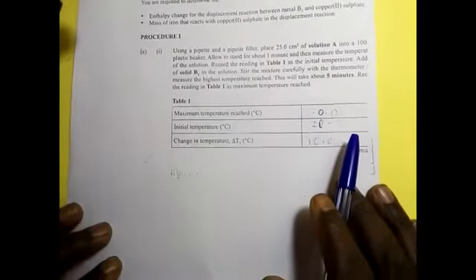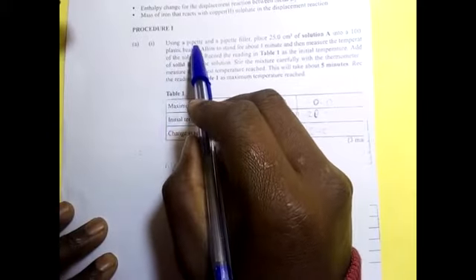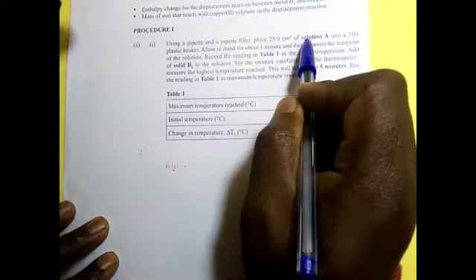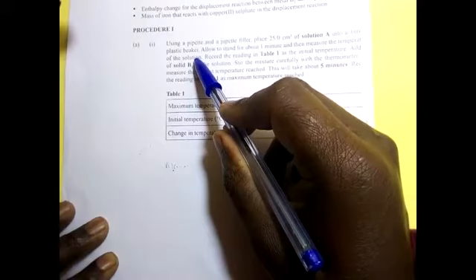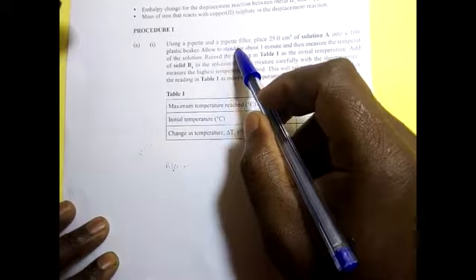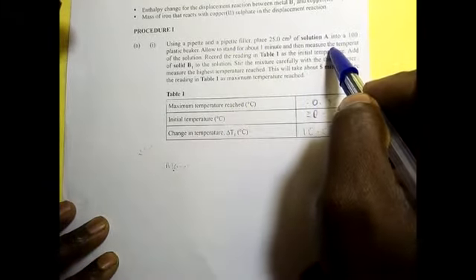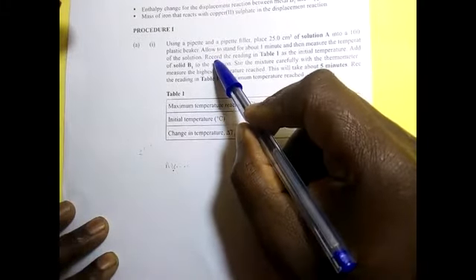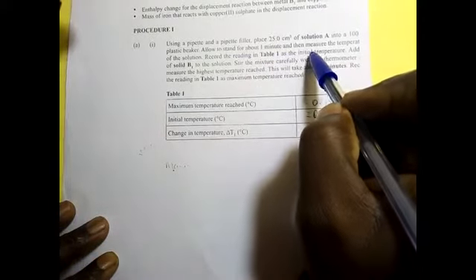Procedure. Using a pipette and a pipette filler, place 25 centimeters cube of solution A into a 100 plastic beaker. Allow to stand for about 1 minute, and then measure the temperature of the solution. Record the reading in table 1 as the initial temperature.